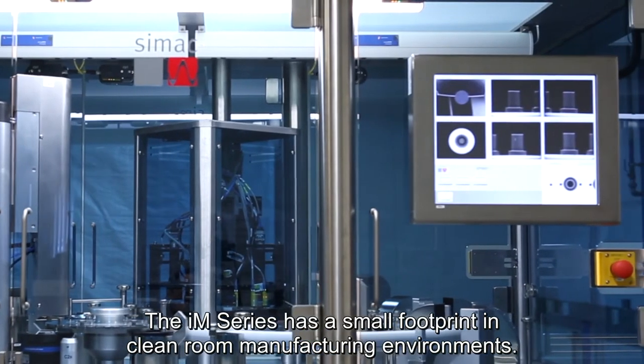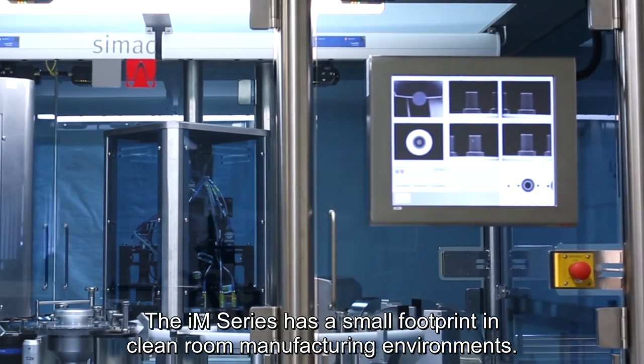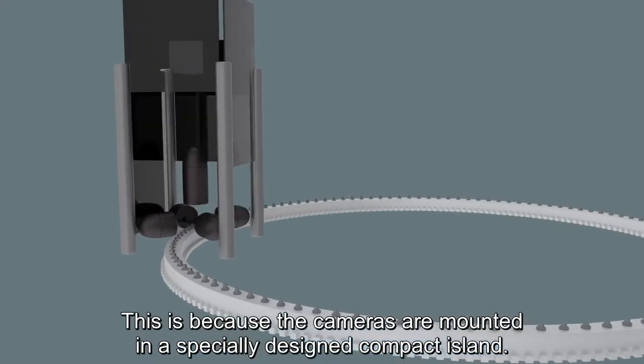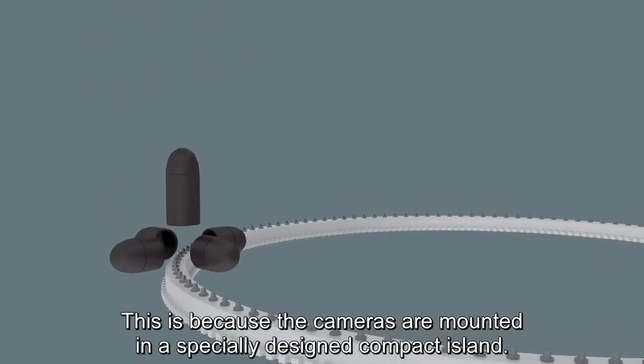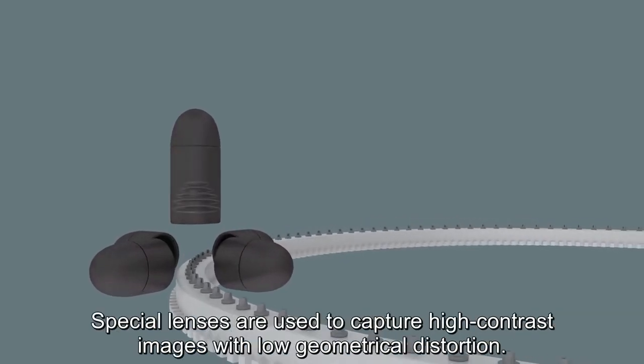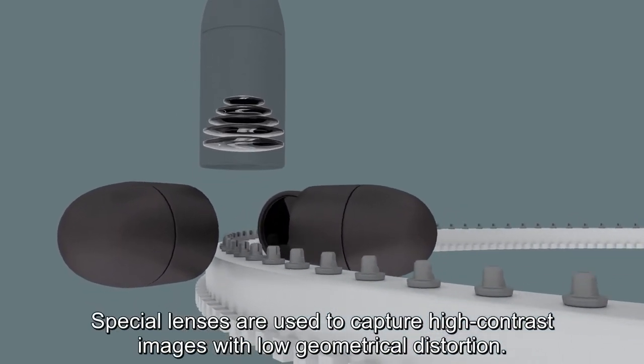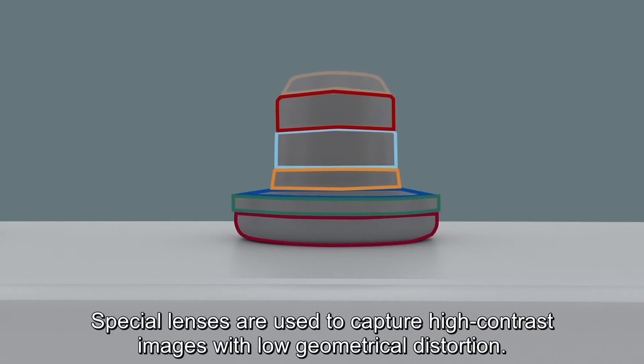The IM series has a small footprint in clean room manufacturing environments. This is because the cameras are mounted in a specially designed compact island. Special lenses are used to capture high-contrast images with low geometrical distortion.